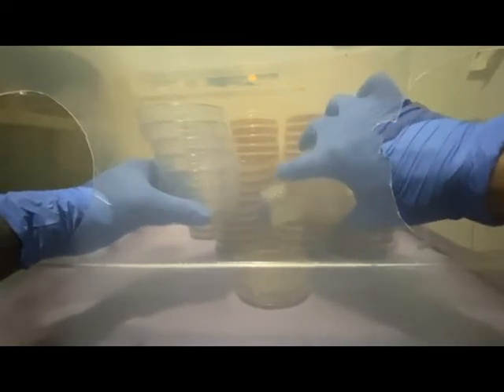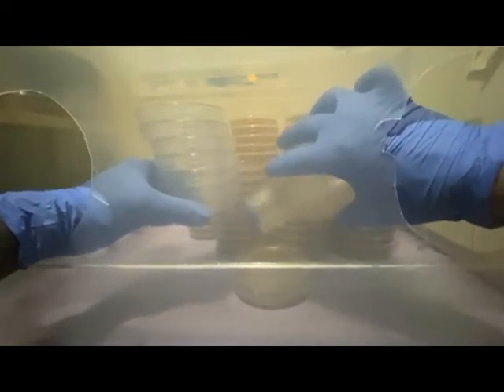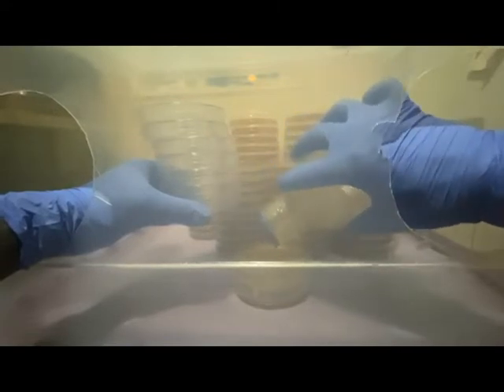But I have bumped into some scenarios where it's been past 72 hours and I'm running into cross contamination or contamination in general, whether it be yeast or Trichoderma.